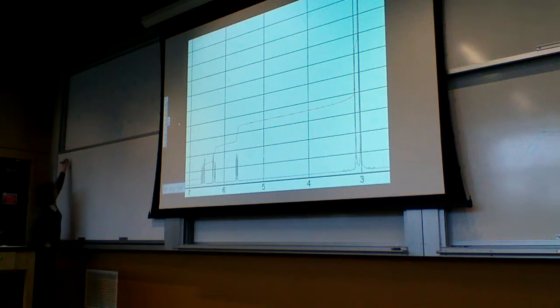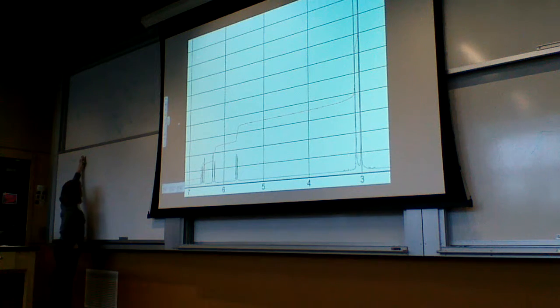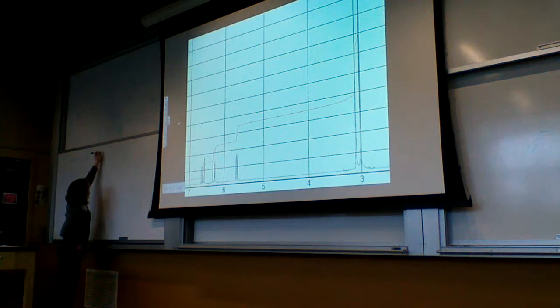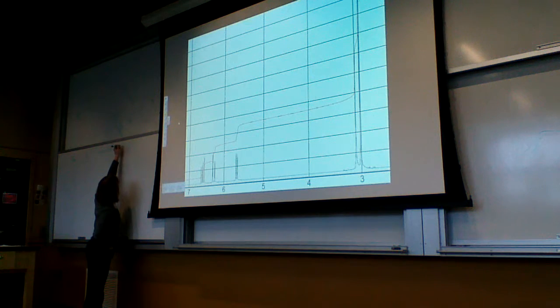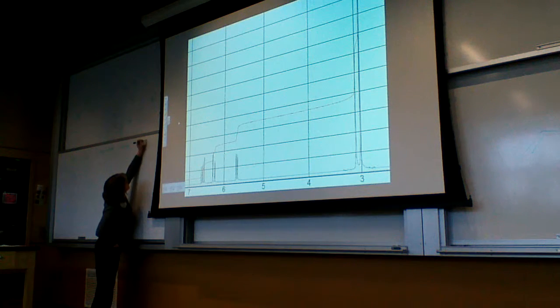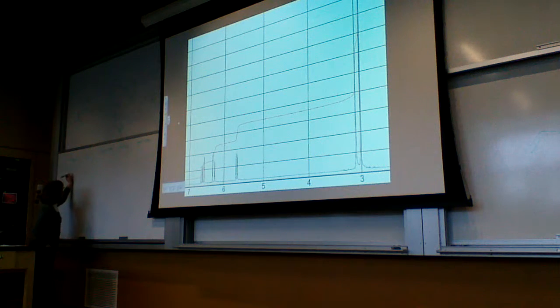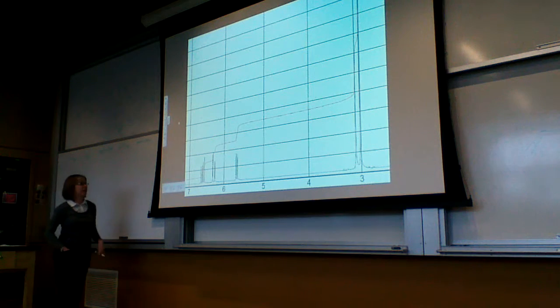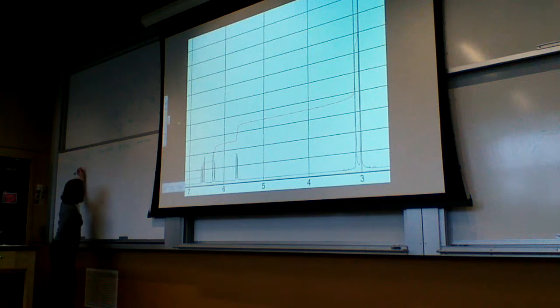We're going to go through another problem for structure determination here. So we have the spectrum. We want to have the chemical shift, the integration, splitting, and conclusion. So I have 5 peaks here. You can start on either end. I'm going to start on the end that's closest to me. So this is about 6.6 parts per million.